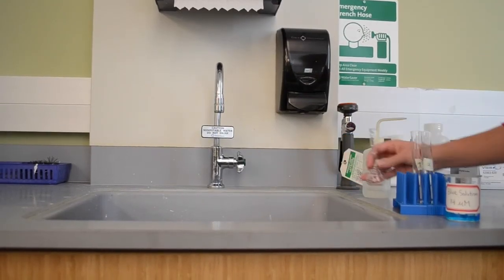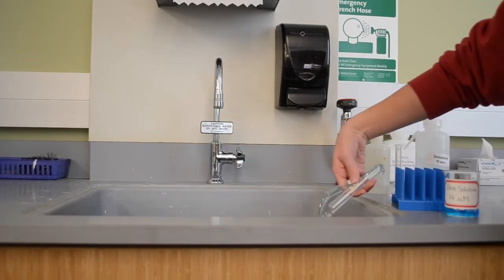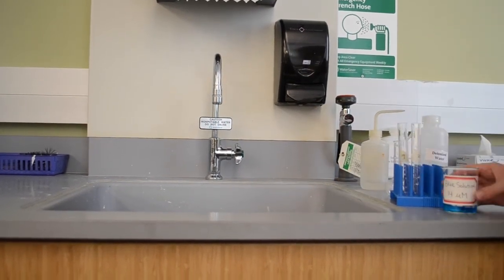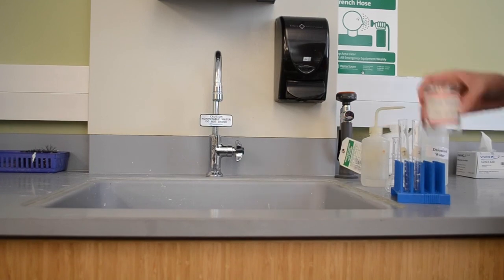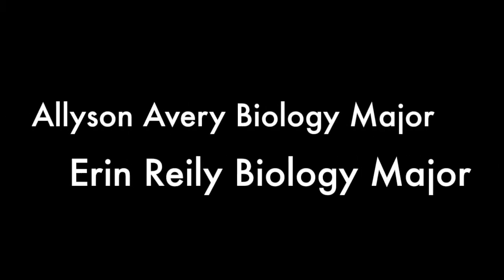To clean up, all of these solutions can be poured down the drain since only food dye and water was used. Make sure to rinse your glassware before putting it back in the container. Thank you.